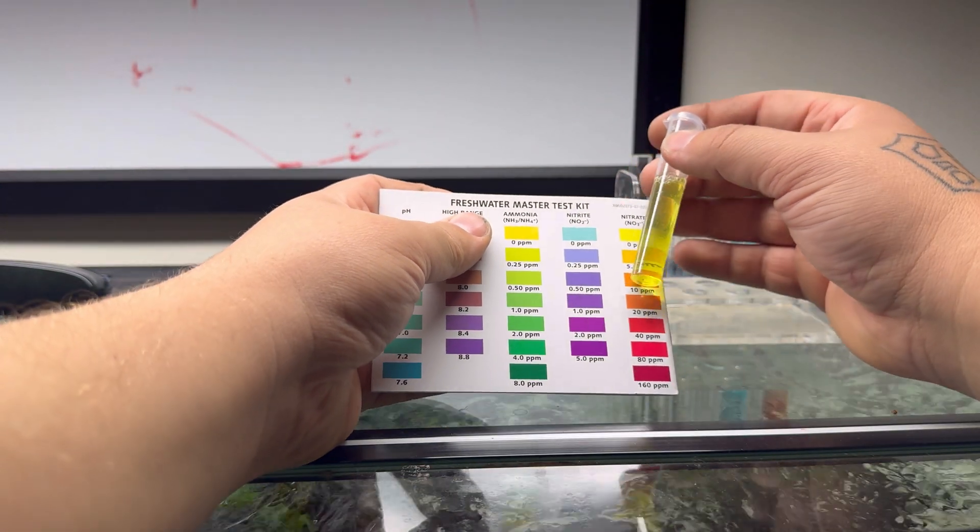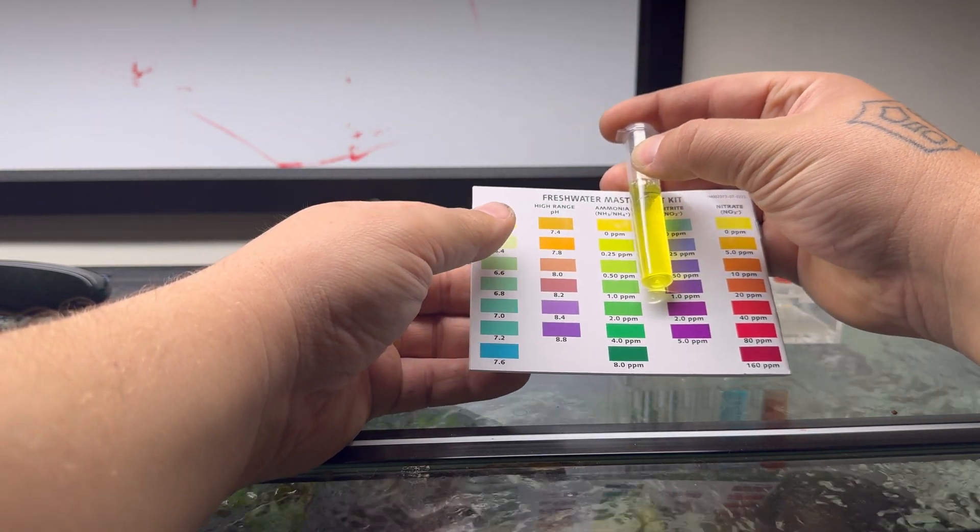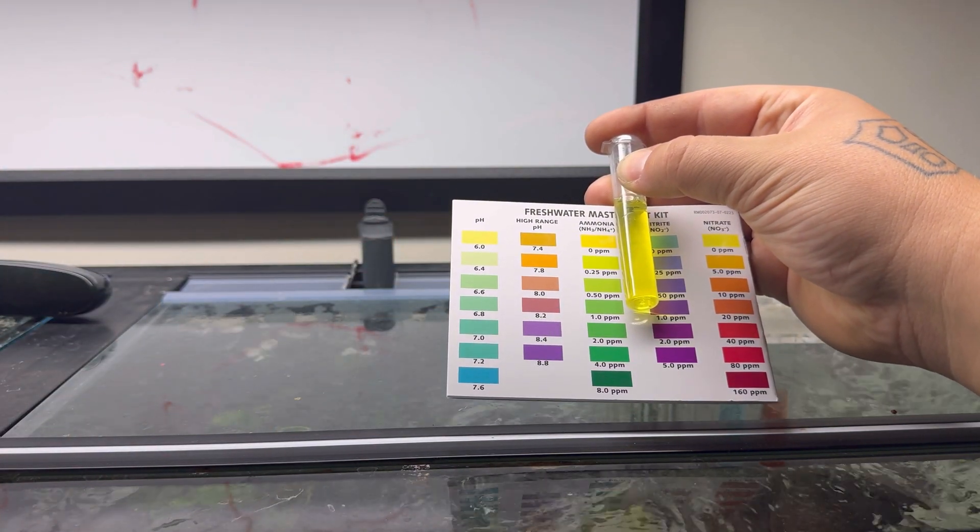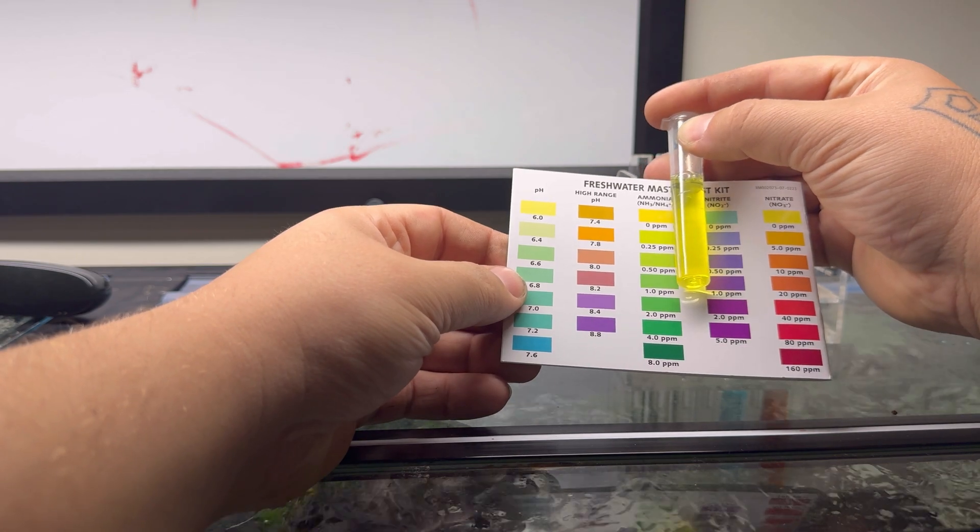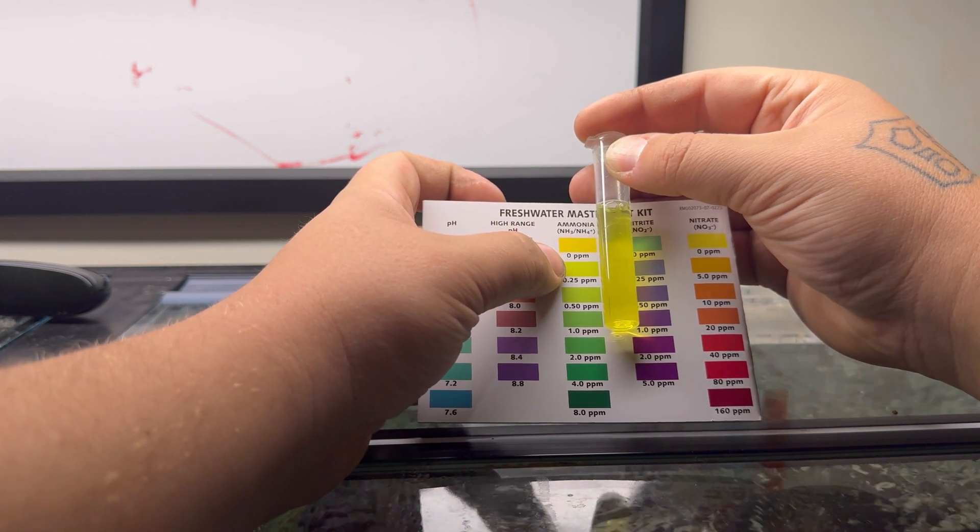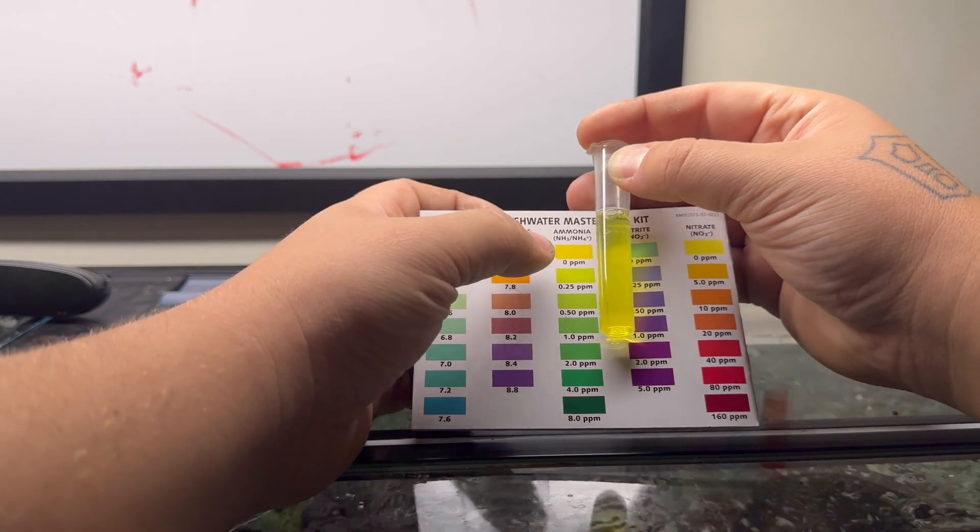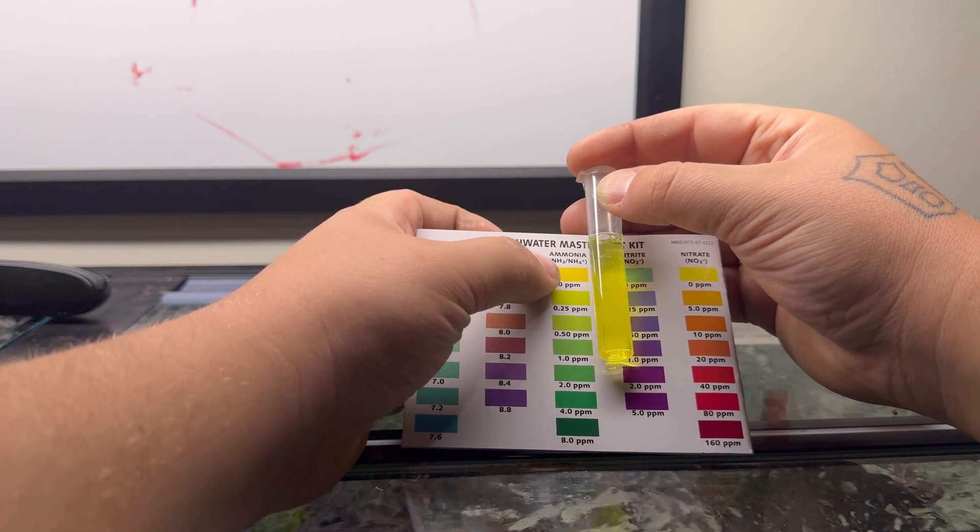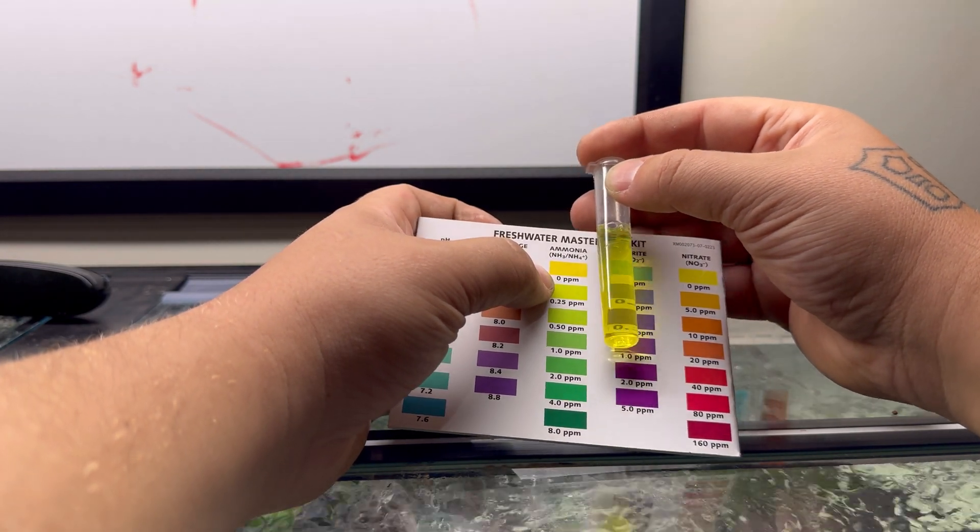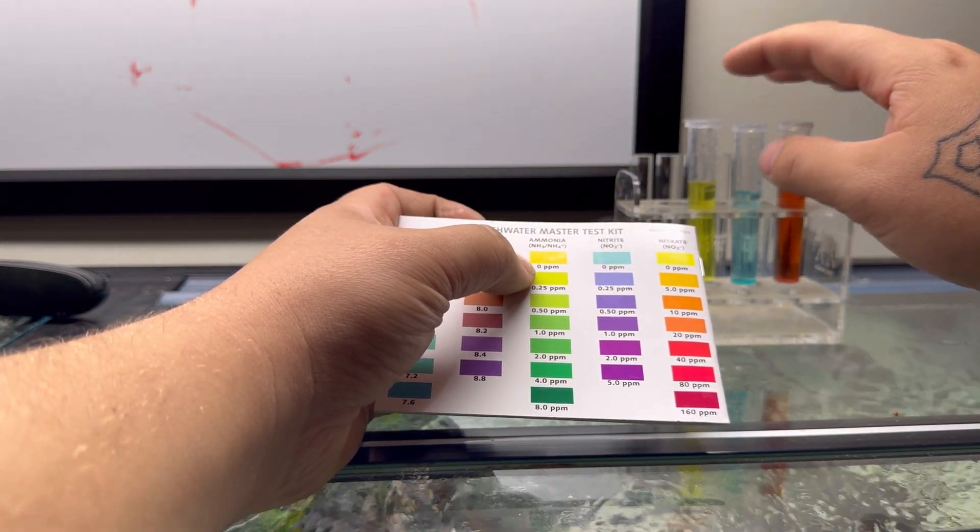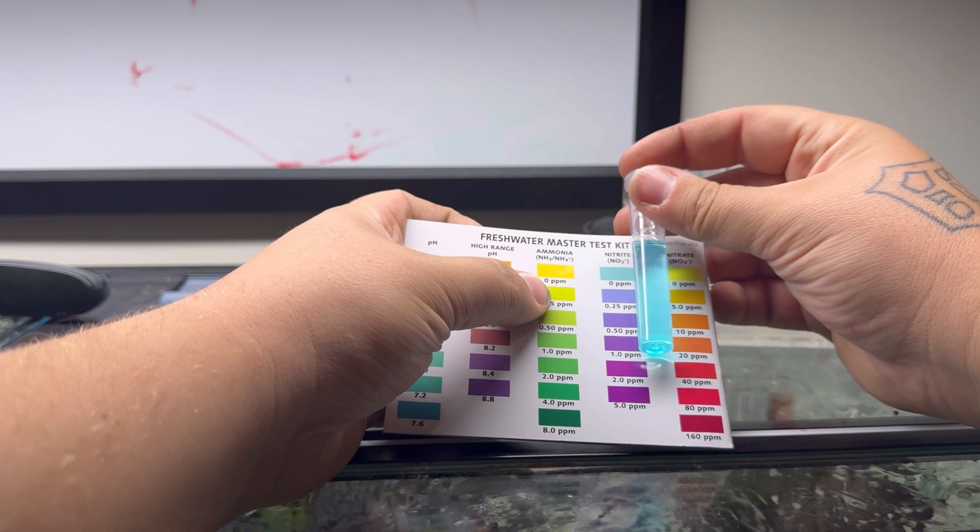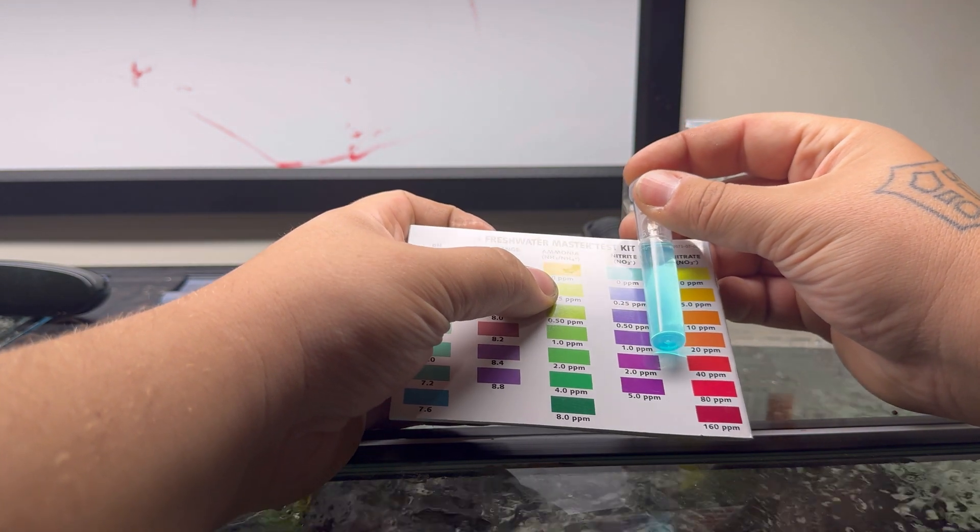You read it against that back there. Like I said, it looks like on video that I have 0.25 parts per million. I can assure you that it is at zero, it's just the way the video looks. You're going to want to do this under natural lighting or an aquarium light like this. This is a daylight 5000 Kelvin shop light, so that's about as daylight as I'm going to get right now.